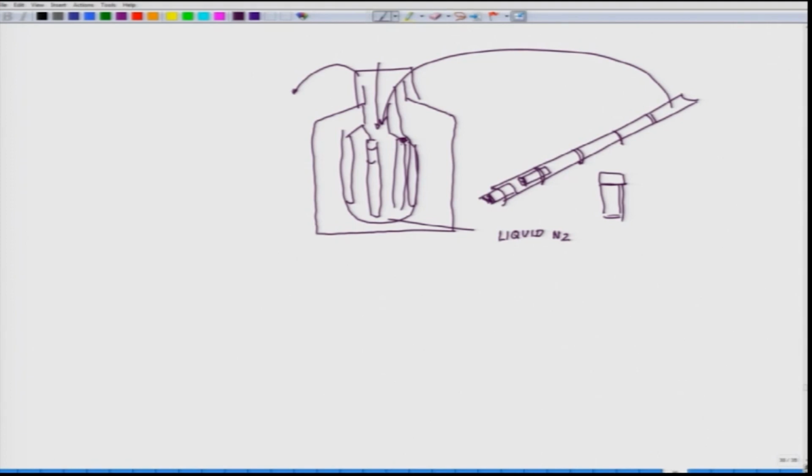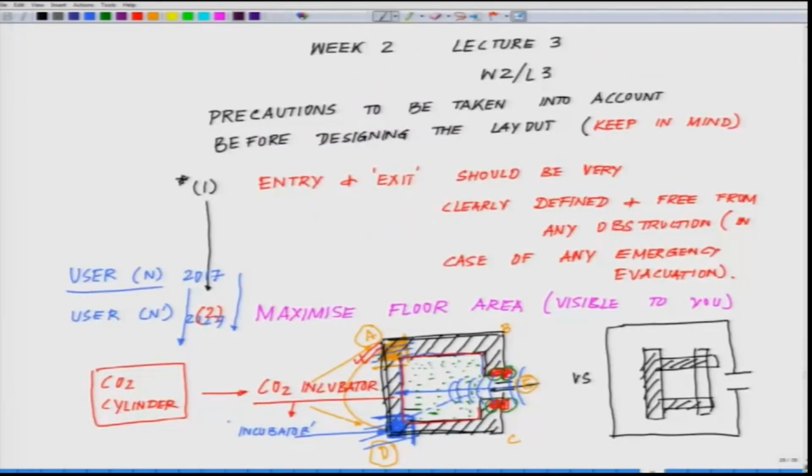So, you have to replace it over a period of time, or every week or likewise. You have to understand where you want to keep them, because these are heavy stuff. Coming back to the design, you have to have a designated spot where you think this is the best spot, I can keep it here, because every time you have to pull this out of the lab, or bring the nitrogen can and fill it. You do not want to travel all the way out here.